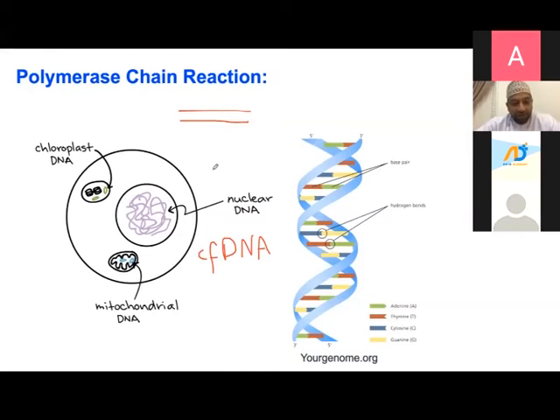If you are from the oil field, you can work on the bacteria that you get in the oil. If you work in the human field, like in the diagnostic in human diseases, you can actually extract DNA that might contain virus for you if you want to study if there is a virus or no virus, or if there is a bacteria. And not only that, sometimes you do get a bacteria, like this is the bacteria in your blood. You want to know whether this bacteria is actually sensitive to a drug or resistant to a certain drug.